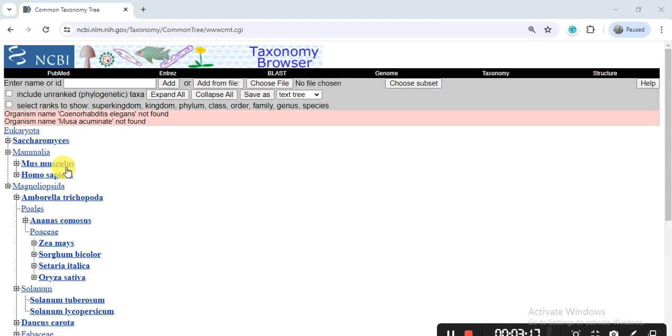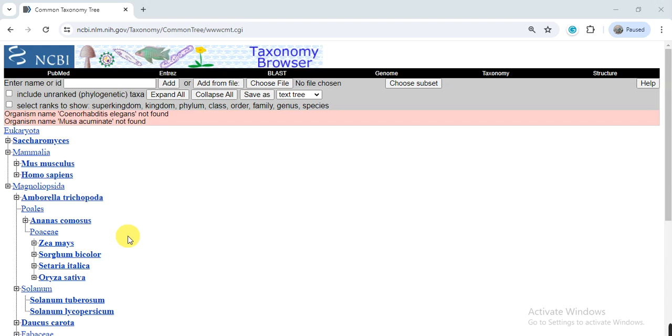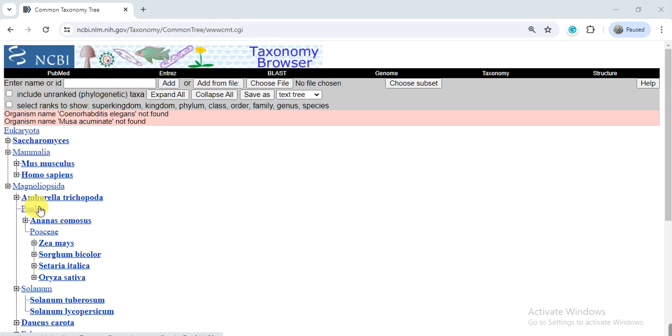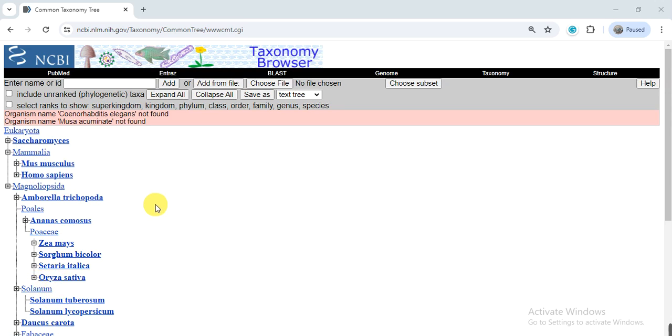So it will give you the list of those species that you have entered, and here they give their phylum, the group they belong to, like Poaceae. These are monocots, Solanaceae, like this. Now we want to make the tree.